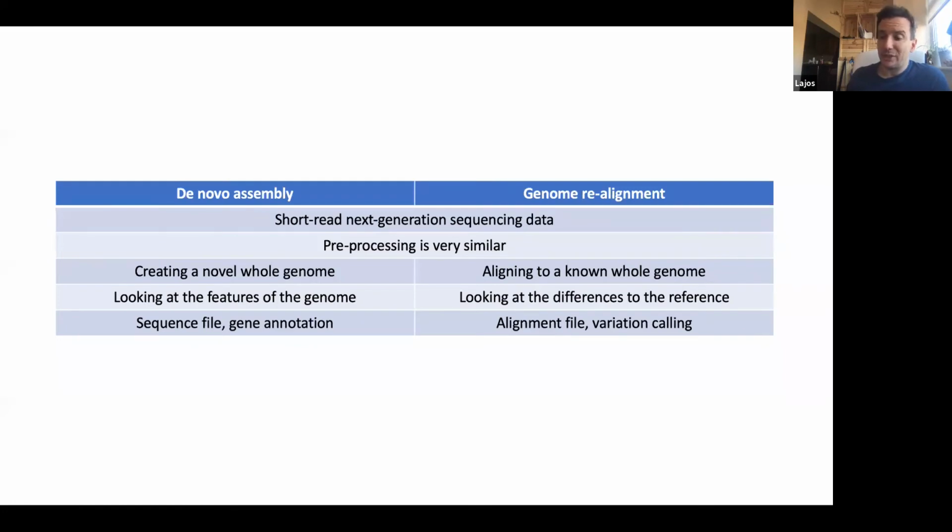And you need that good amount of CPUs, good amount of memory, because if you remember, when you do a whole genome assembly, you basically have to have all the reads in some way within the memory at the same time, because it has to combine all those reads. It has to find all the overlaps between reads.